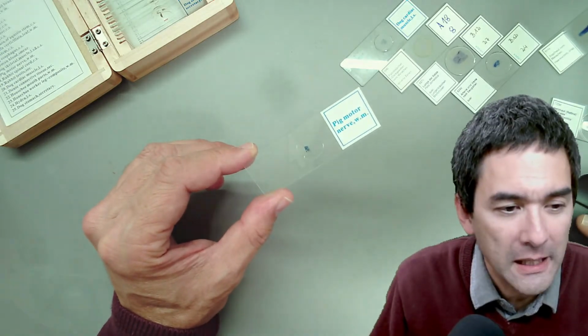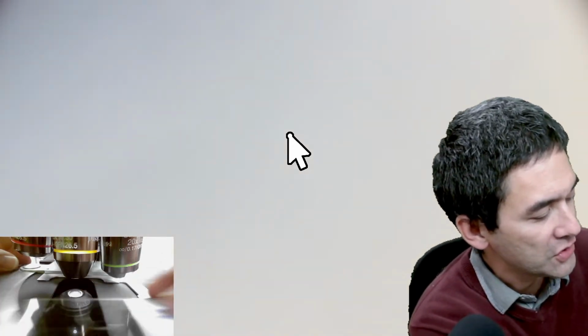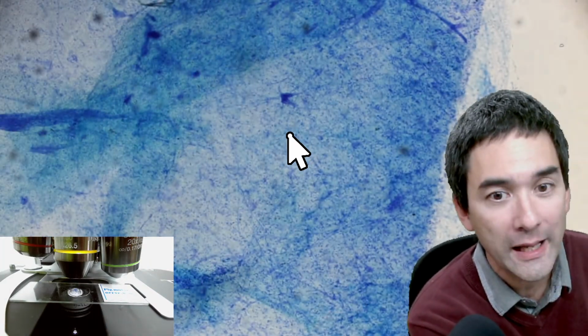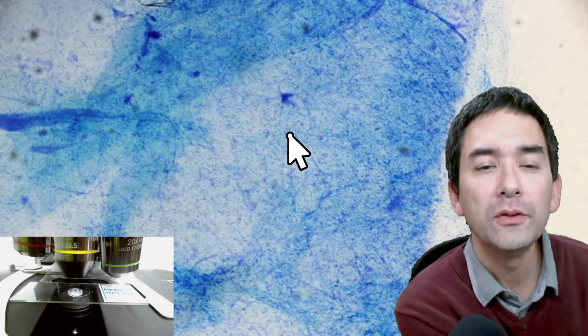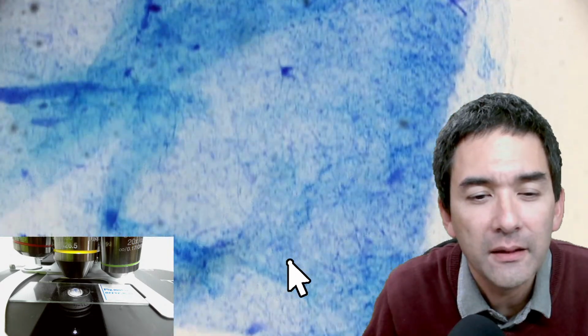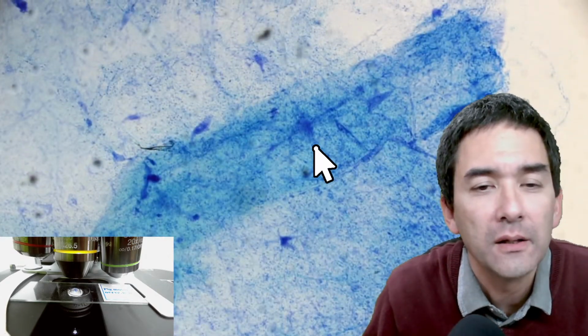Because actually I was kind of hoping to be able to see the individual nerve cells, the individual neurons. But this is difficult here because they're all so together. But there is one thing that you are able to see a little bit occasionally. Okay, so that is supposed to be nerve. But where I want you to direct the attention to is the following. You're going to see that sometimes there are those horizontal fibers running. Okay, you see there are some lengthy fibrous structures. Yeah? And these seem to be the so-called axons of the nerve cell.